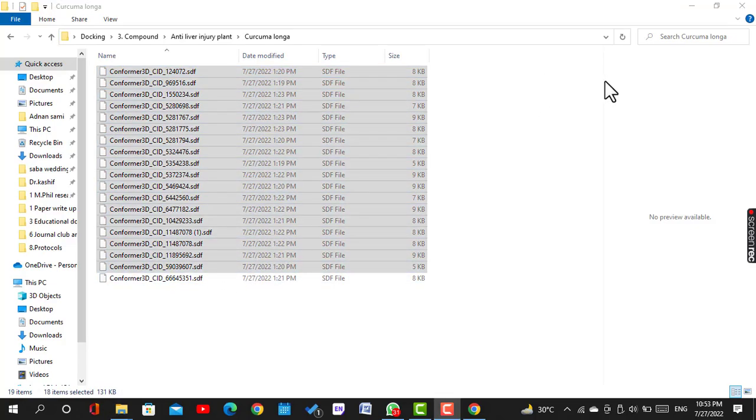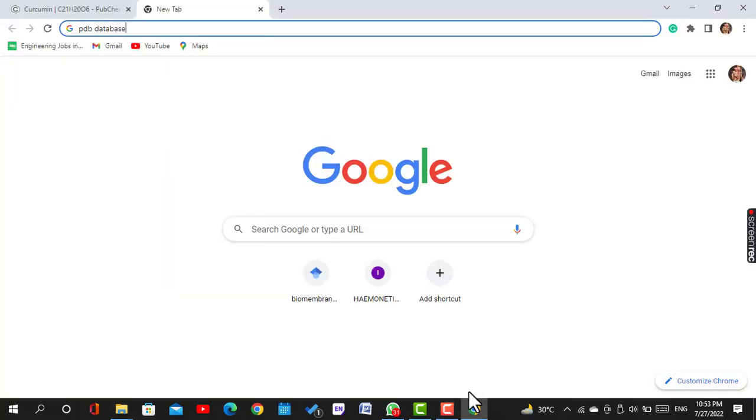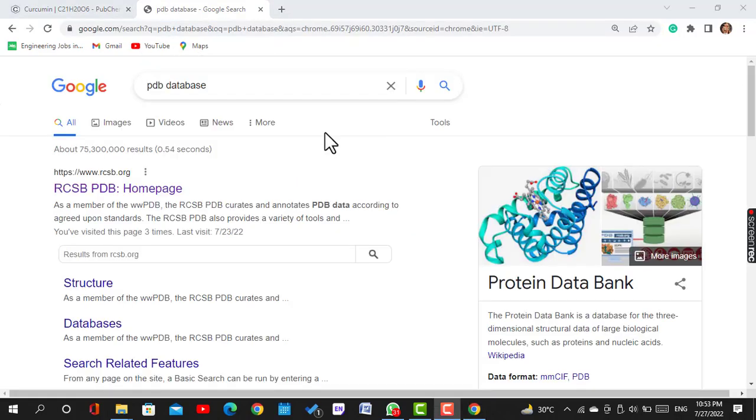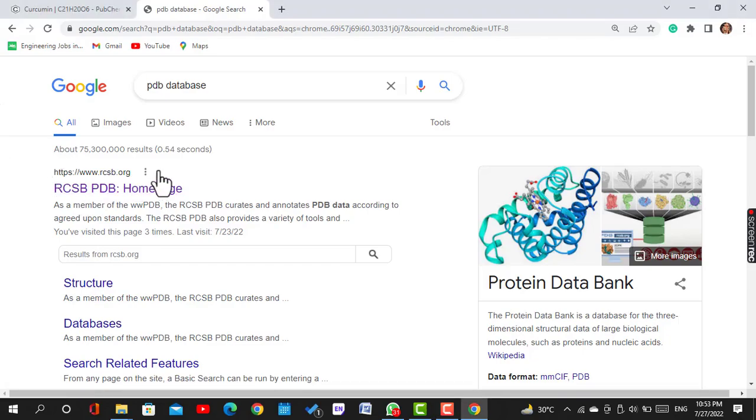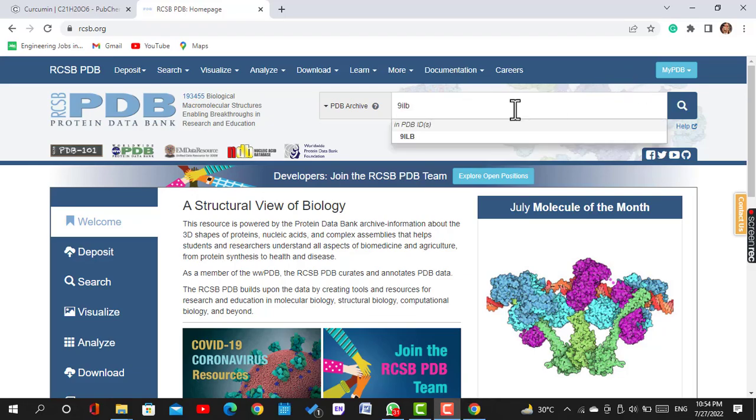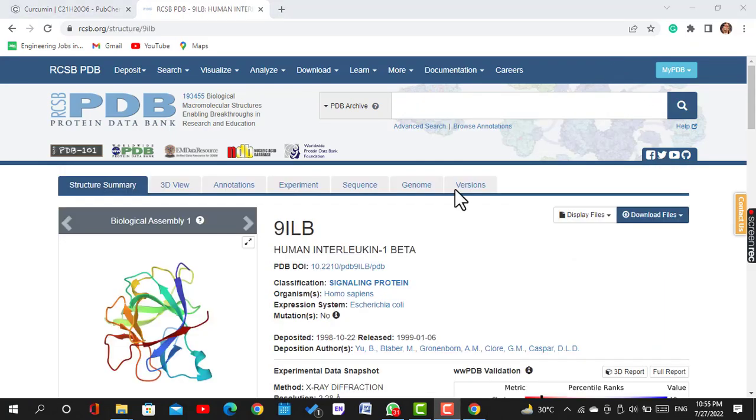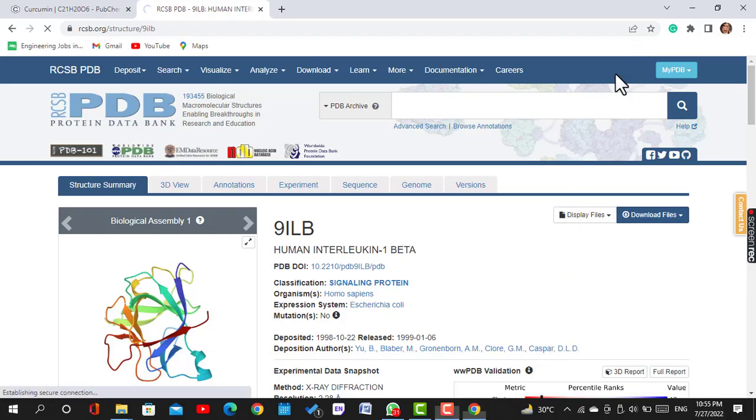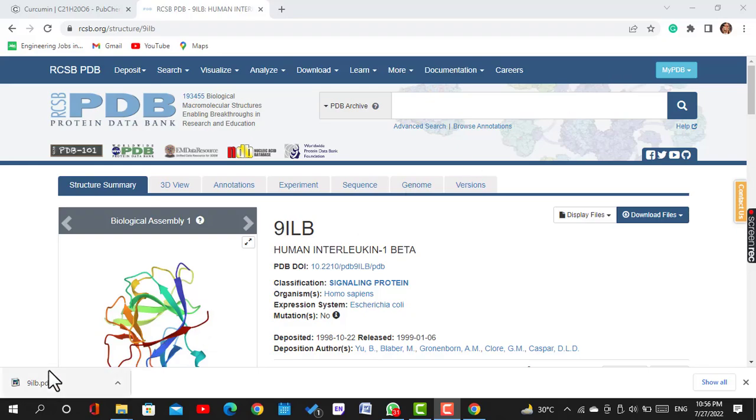Next we download 3D structures of the receptor. We open PDB, Protein Data Bank website. Here we search for the desired receptor protein. For example, I want to search 9ILB receptor protein. This one is the 9ILB human interleukin 1 beta. We download its PDB format. This one is your desired receptor protein.